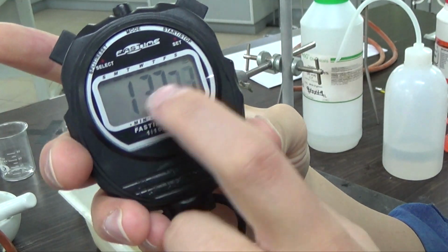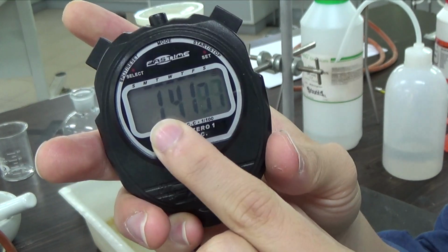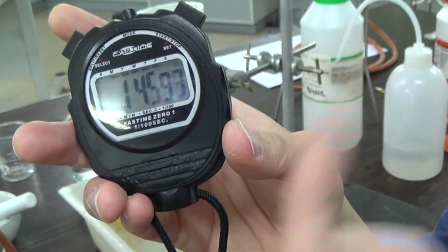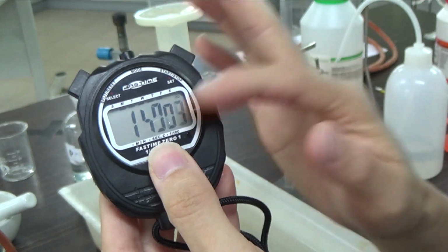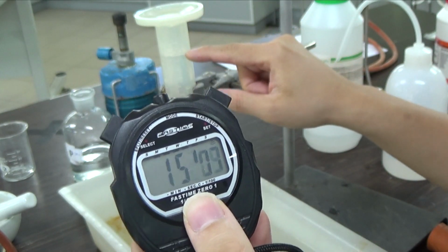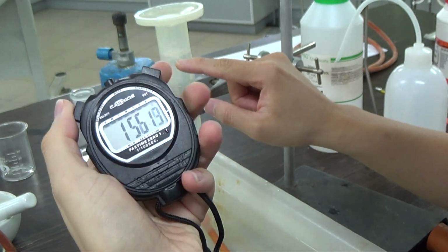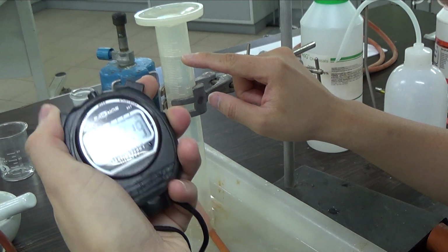So this is minutes, this is seconds. In 1 minute, there are 60 seconds. So when you have 2 minutes and 0 seconds, there will be 2 minutes times 60, which gives you 120 seconds. I'll stop timing at 2 minutes, and then I will record the volume of the gas at 2 minutes. Okay, so it's getting close. Gas will still be produced, but I will stop reading at 2 minutes.